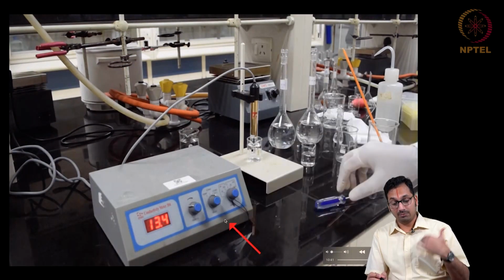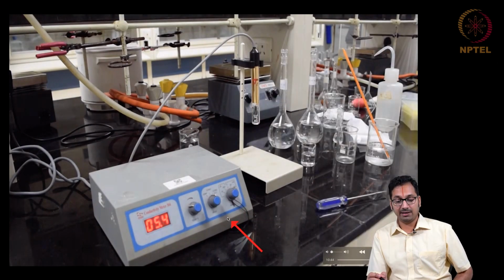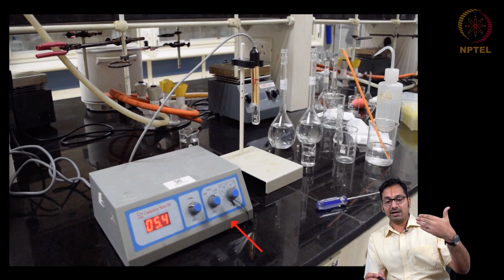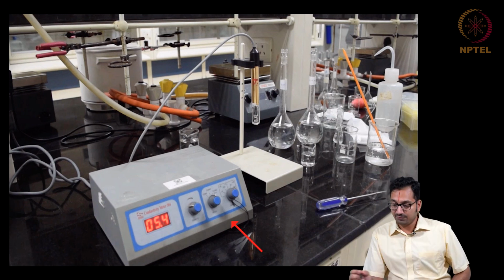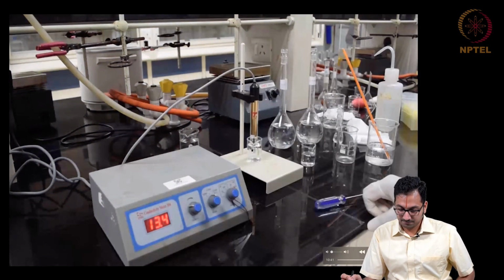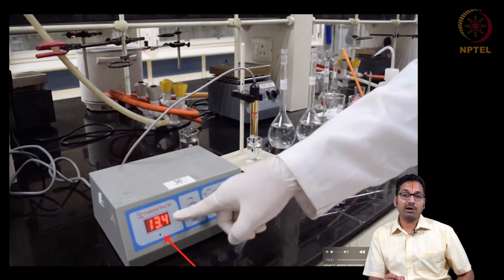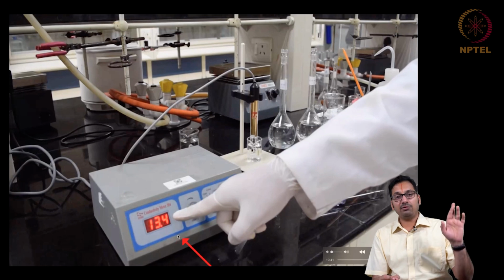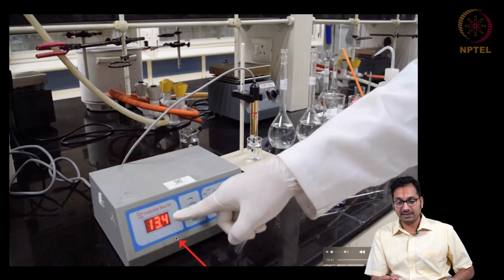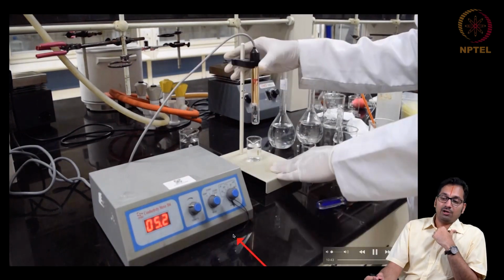So that could also result in systematic errors, and you realize that the researcher makes sure the value agrees with the literature value which we just saw a moment back, which is 13.4 millisiemen. So now that you have calibrated it at 0.01 molar KCl and 0.1 molar KCl, you are all set to make your measurements.